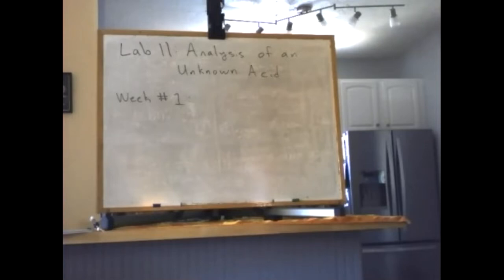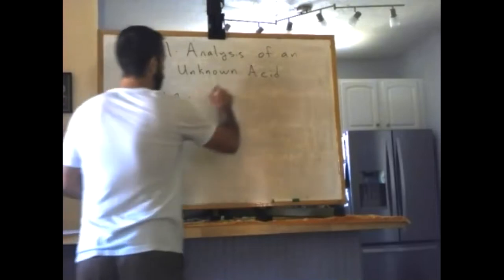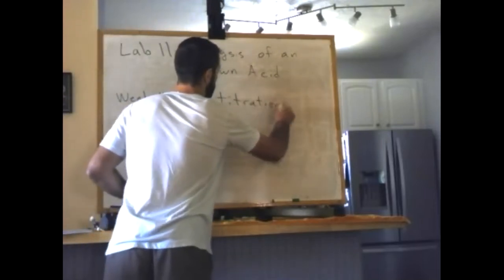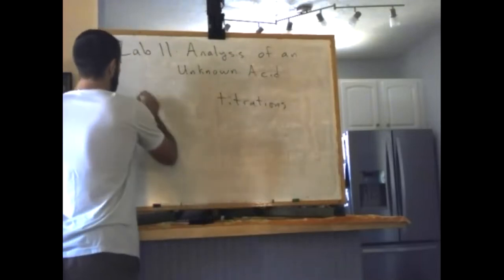But you'll get to, at some point in the future, what we're going to be doing are what we call titrations. And more specifically, we're going to be doing acid-base titrations.